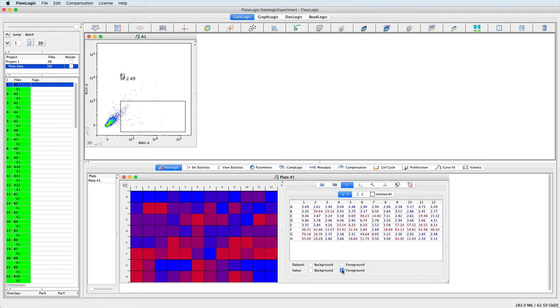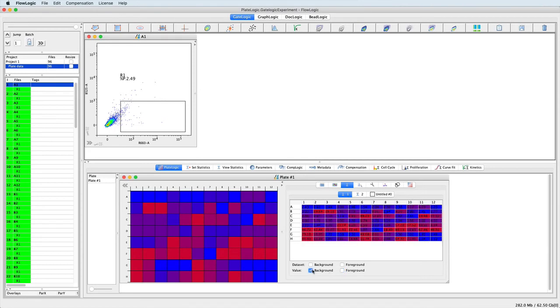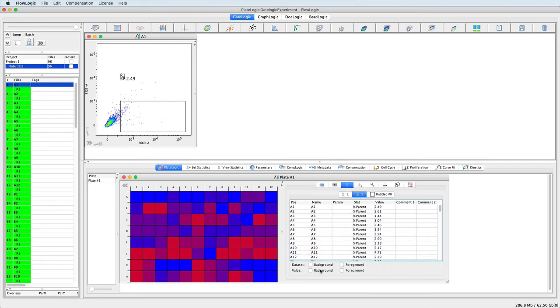the heat map, and this colouring will be exported with the tables if they are displayed. These results can also be displayed in columns, which again can be coloured to match the heat map. Comments can also be added to individual samples.